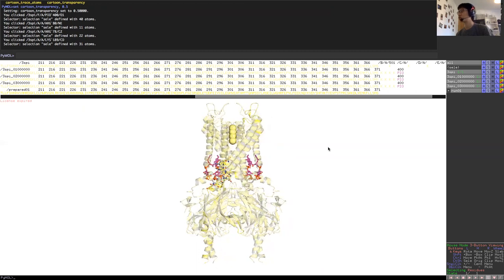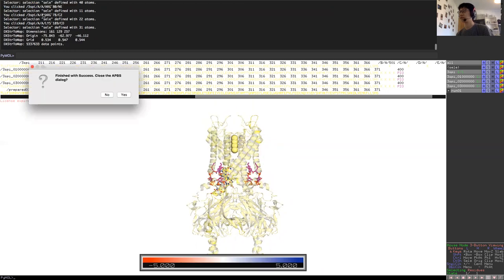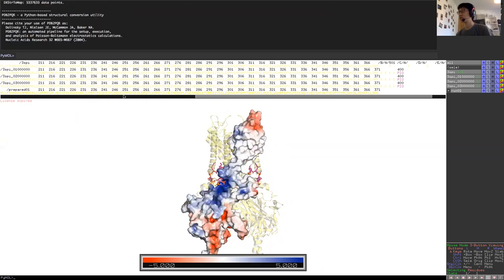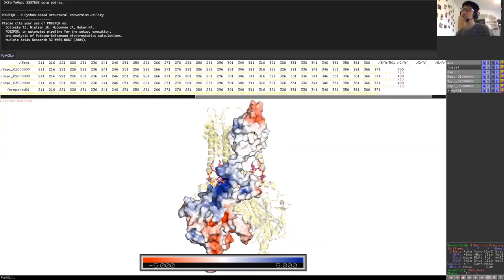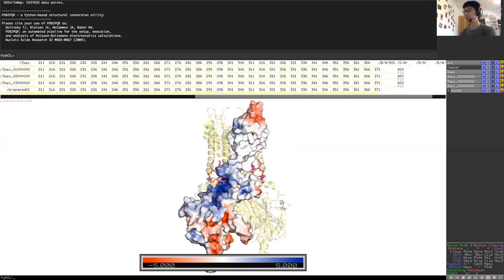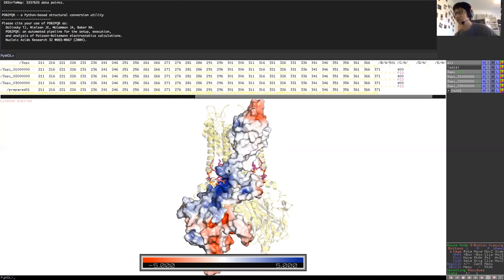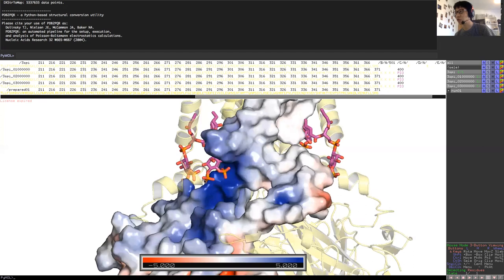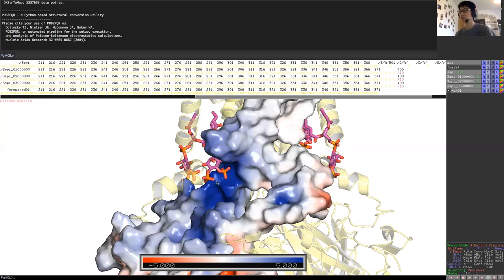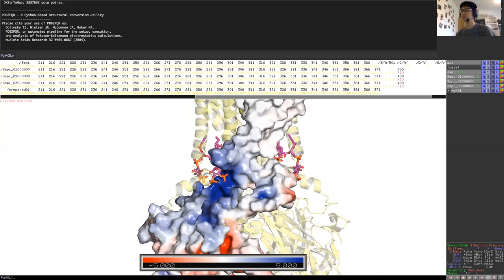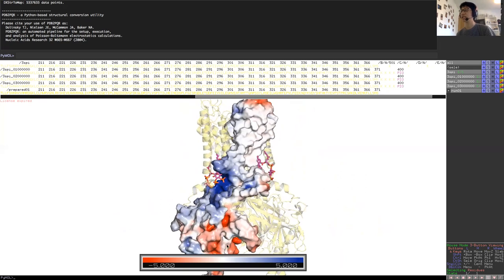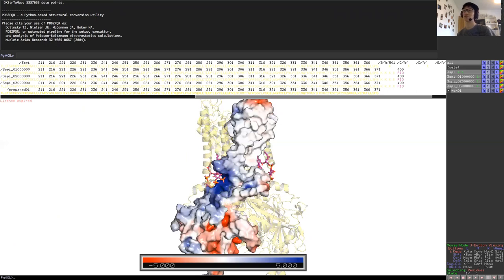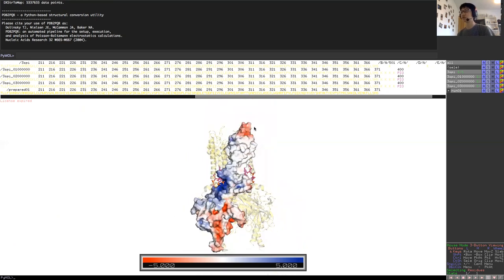What you can see now is that it shows you electrostatic surface. Here, the transmembrane region is white because it needs to be embedded in the bilayers. It's rather hydrophobic and not interacting much. You can see a very dark blue groove in the structure's electrostatic surface accommodating these phosphate groups of the PIP lipid. And the other part in a soluble region that is exposed to the solvent are rather having some polar surface charge, allowing the cytoplasmic domain to be water soluble, also at the loop to be water soluble here to have a bit of charge.